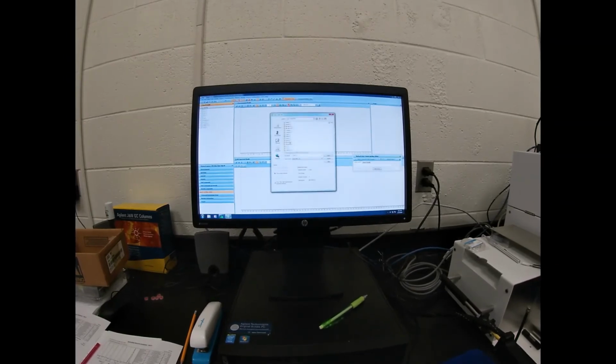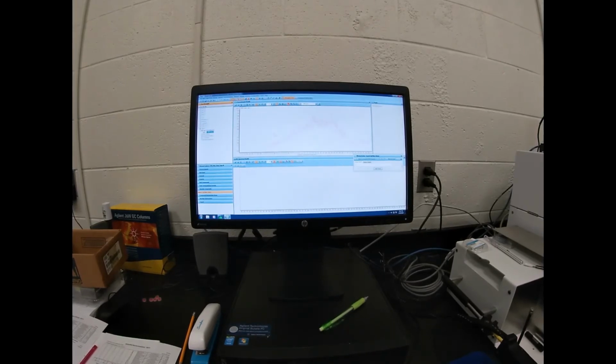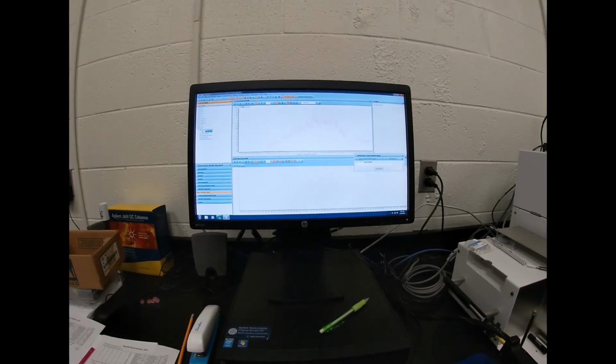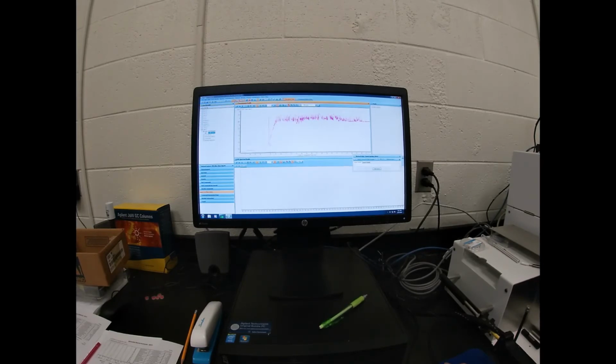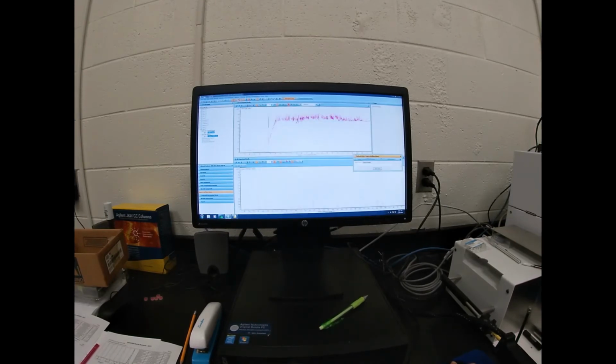Run that I did for our Coke sample right here. Here we actually see, I think I need to show the whole thing. There we go. Oh, here we go. What is that nice big peak right there? In this search, we get cocaine, as we expected, so that's good. Cocaine is there.